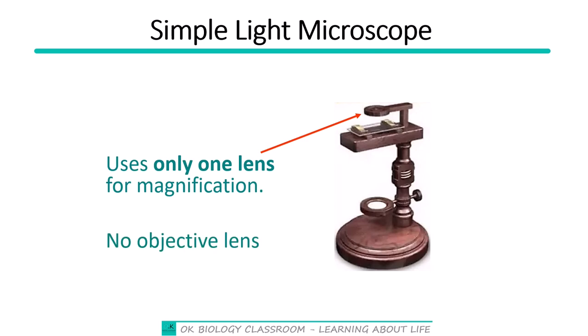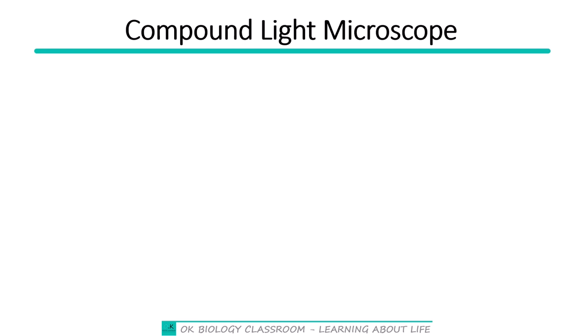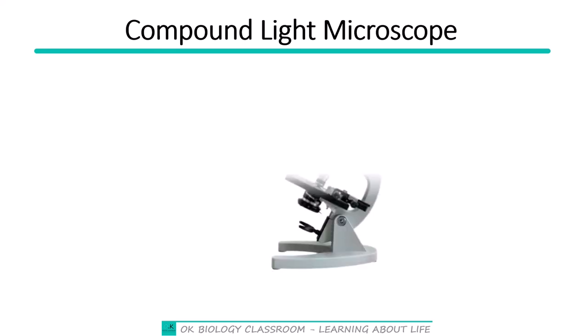So as distinguished from the other, which is the compound microscope, this one does not have an objective lens. Now we move to the compound light microscope. Yes, this is a very common one that we see in our school labs and in the hospitals.